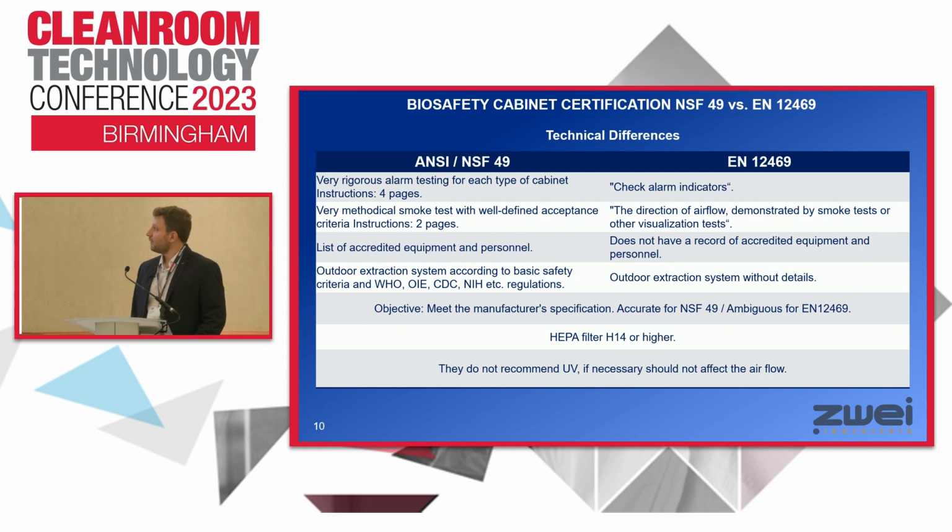NSF has a list of accredited equipment and personnel, technicians, who have proven their ability to certify biosafety cabinets. EN doesn't have that.